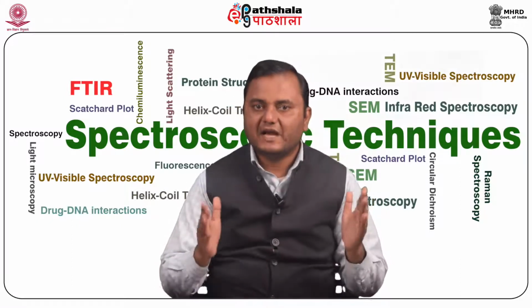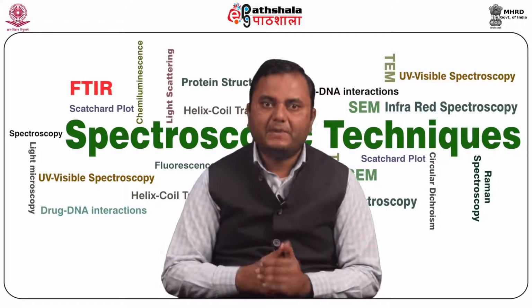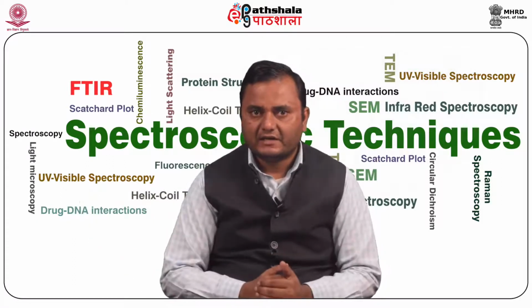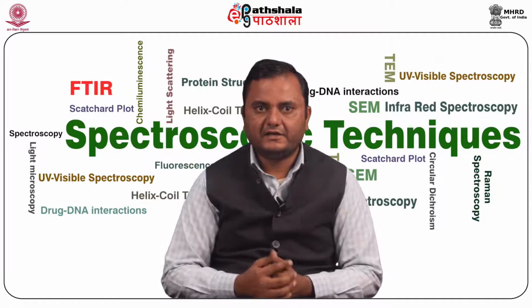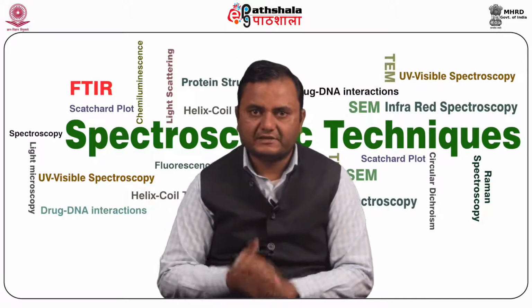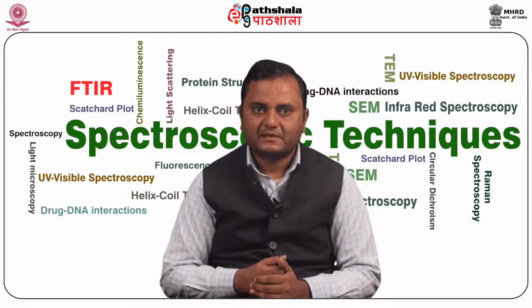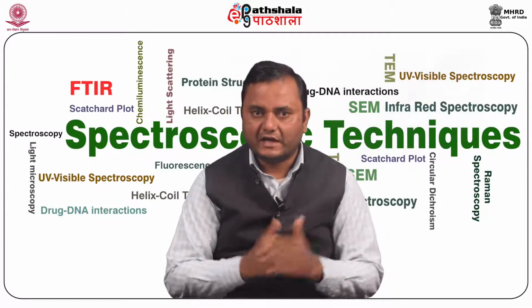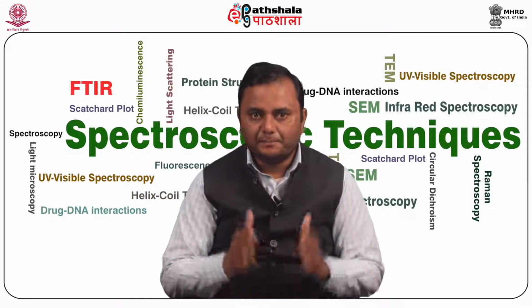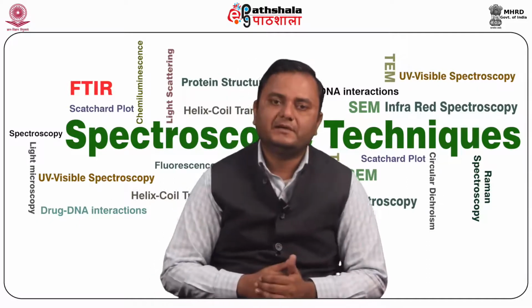It has a simple light source, where IR energy is emitted from a glowing black body source, coupled with the interferometer. The beam enters the interferometer where the spectral encoding takes place, and the interferogram signal then exits the interferometer. The beam splitter takes the incoming beam and divides it into two optical beams.